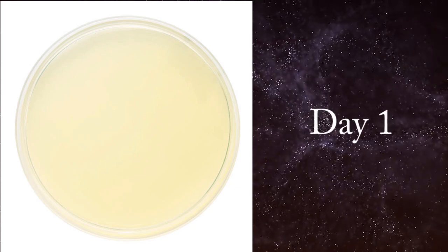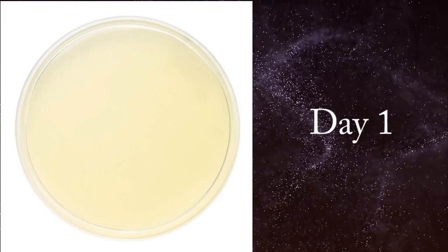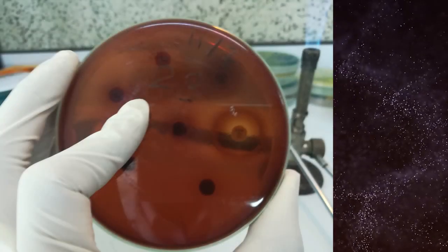After incubating the Müller-Hinton-Agar plates overnight, the color of the Müller-Hinton-Agar plate was converted into brown color.